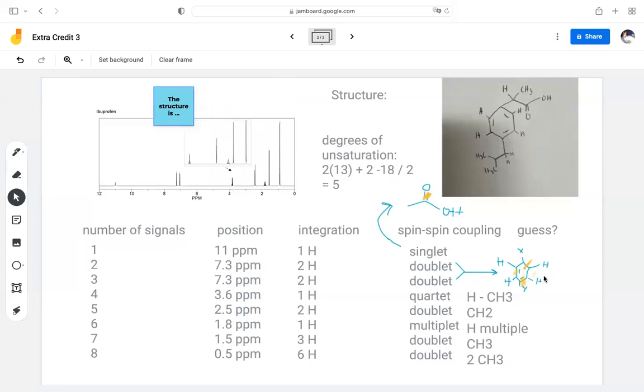Again, we see the benzene ring in this formation with the 2 H's on either side. That corresponds to the 7.3 ppm for both signals 2 and 3, on the integrations of both 2H of the doublets. So we were right in predicting that. Also, obviously, since there's a benzene ring, we know that there's 5 degrees of unsaturation, as I pointed out a little bit earlier.